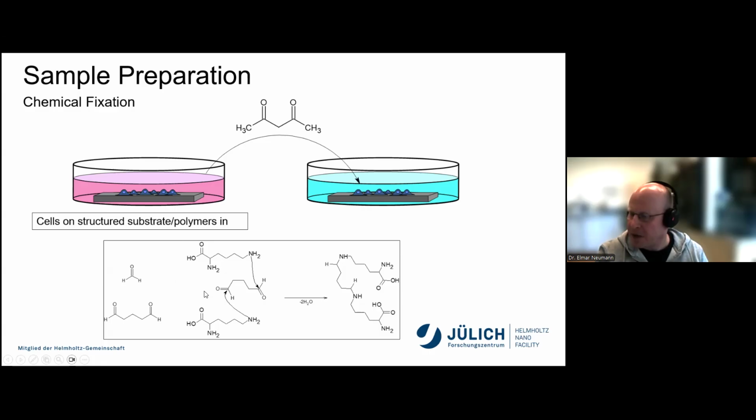These aldehydes cross-link the amino acids of the proteins, particularly lysine in this case, in order to stiffen, to make the structure somewhat harder.